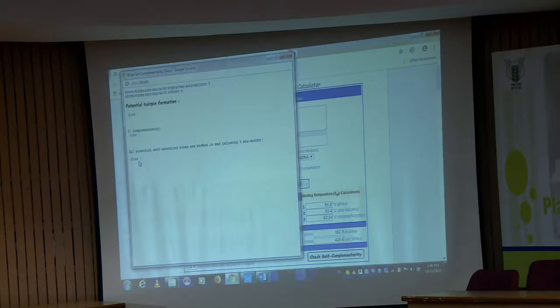In that case, let us suppose 4 bases at the end are problematic, forming some bonding with the internal part. So, we can avoid those 4 bases from that end, and take 4 bases from the other end. We can do that manually also.